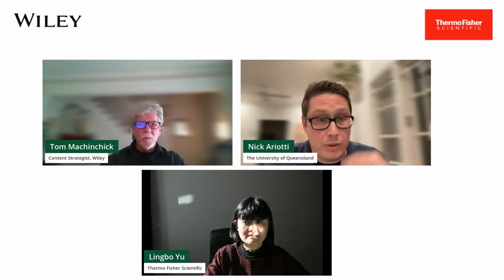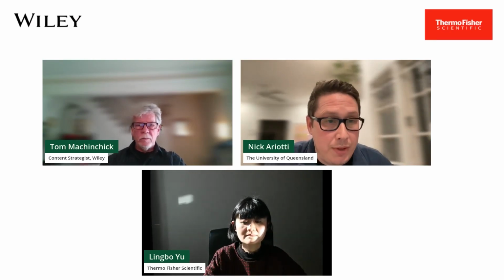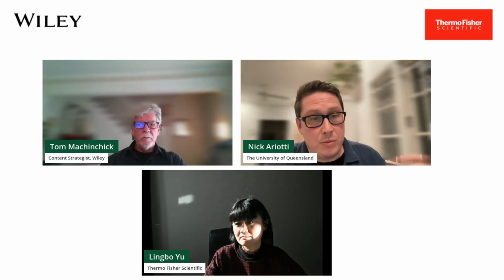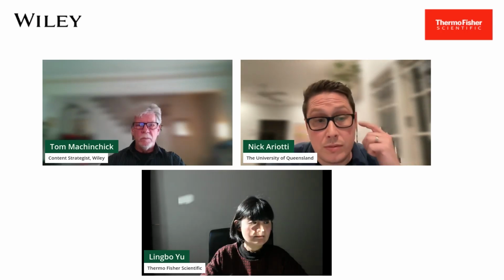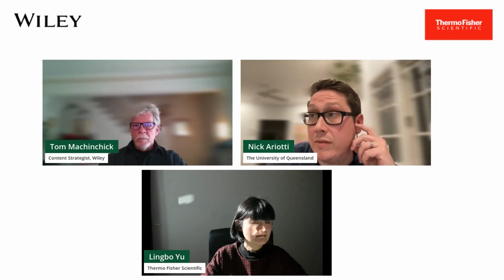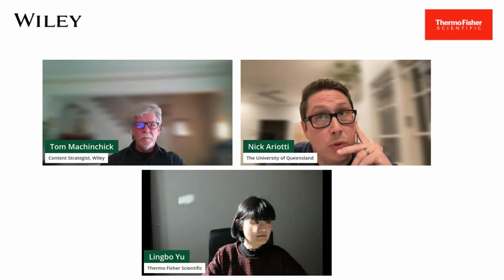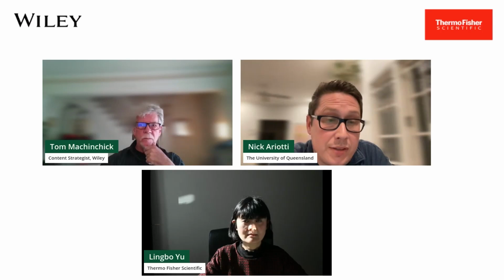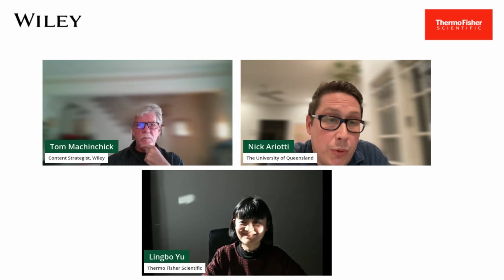Then from there we go back to using our tilt series, and we import them through RELION 5, where we do motion correction. From there we take those tilt series and put them into Dynamo. Dynamo is really great for low resolution initial refinements, and we'll do that in Dynamo. And we'll also use crYOLO. crYOLO is freeware that was developed out of Stefan Raunser's lab, which really is quite fantastic at doing automated particle picking.